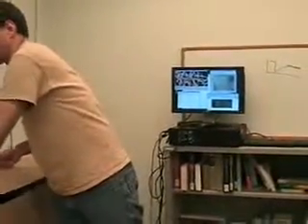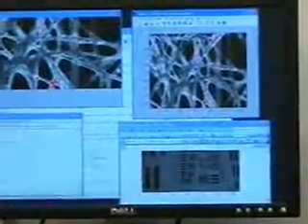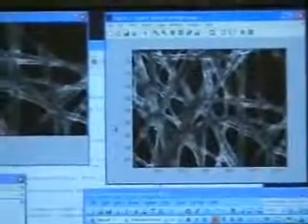I'm going to turn my gain down, and then it looks like I can turn the shutter down a little bit. Notice I have to wait. Now it's updated again. Now I'll keep turning the shutter down till, there we go. There's just a little bit of red floating around, which is what you want, just a little bit. Background is fairly dark, but if I cover things with the box, then the background gets even better. And I may be able to readjust the gain just a little bit for a nice image. So that's how you make the best use of your lamp, your shutter, and then your gain settings for the camera.